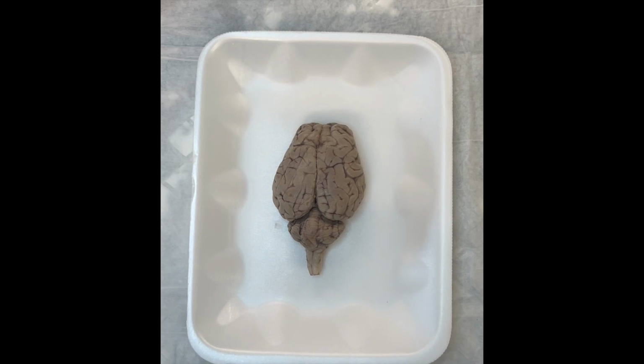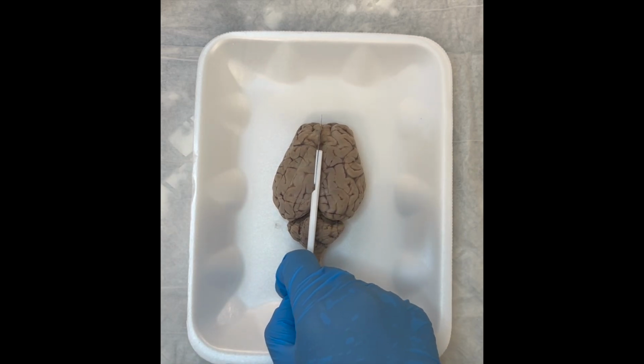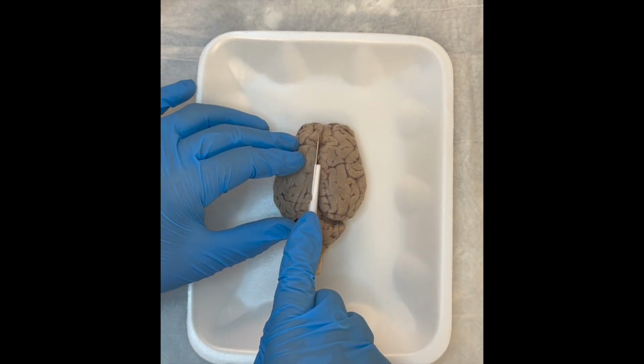All right, so now we are ready to cut our sheep brain so we can have a nice internal view. We want to create a medial section. So we're going to cut right down this median longitudinal fissure here. It's a great guide for us. Nice clean cut all the way through that entire brain.